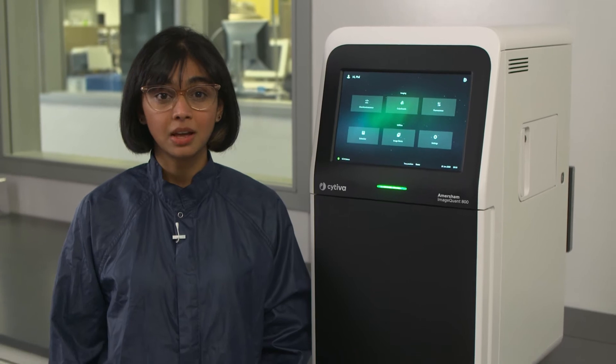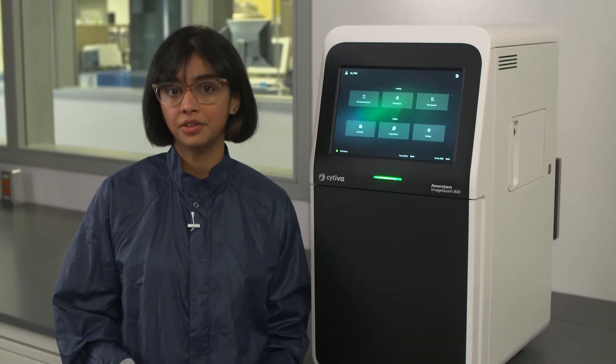Hello and welcome to the video series on Amersham ImageQuant 800 CCD imagers. The ImageQuant 800 is a CCD based camera system for imaging western blots, gels, multiple plates and other samples.